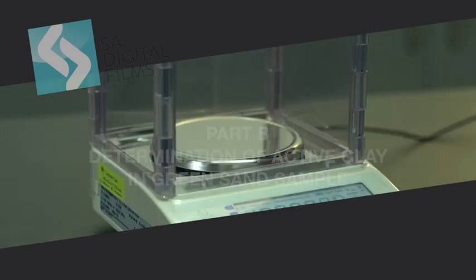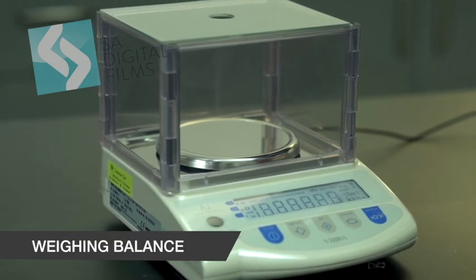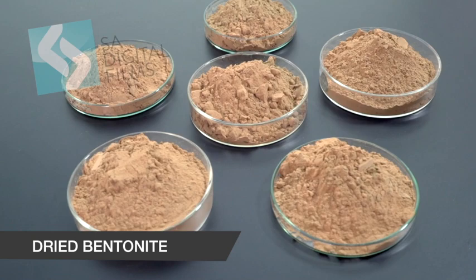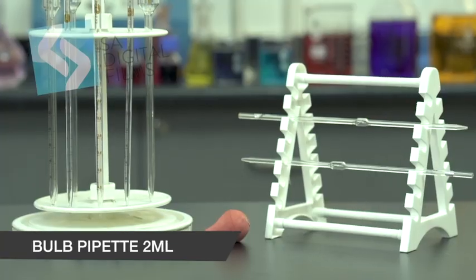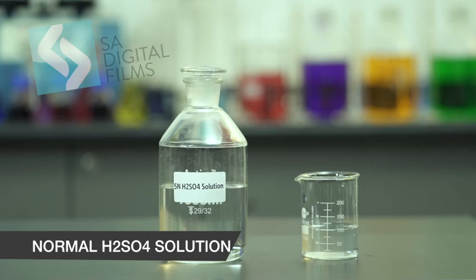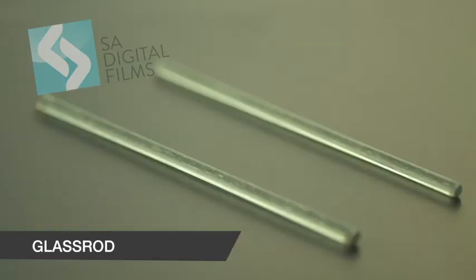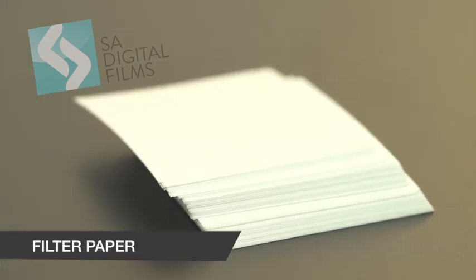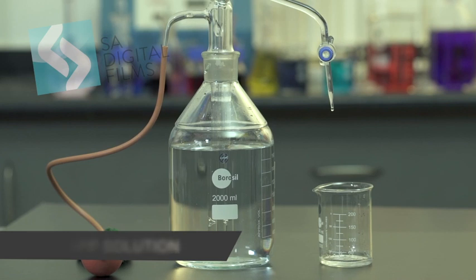For this, we require a weighing balance with least count of 1 mg, dried bentonite sample, dried sand sample, burette, a bulb pipette 2 ml, 0.01 normal MB solution, 5 normal H2SO4 solution, a stopwatch, magnetic stirrer, hot plate, glass rod, filter paper, Whatman number 50 or equivalent, tetrasodium pyrophosphate solution 2%.